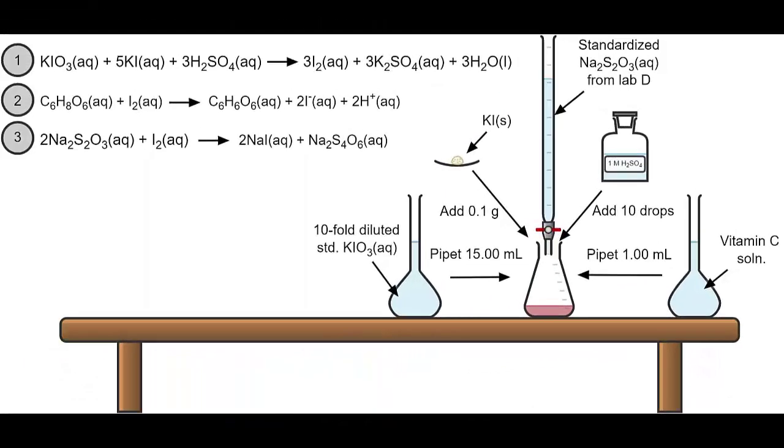This video will demonstrate the steps required to do the volumetric analysis of the mass of vitamin C in an over-the-counter vitamin C tablet. Our goal is to use this analysis to assess the accuracy of a reported value of vitamin C in the tablet.